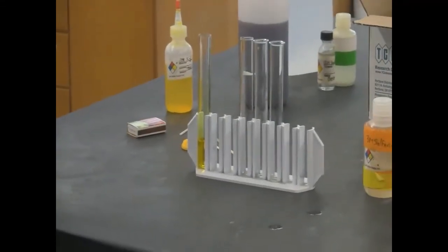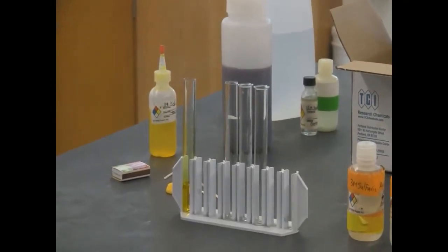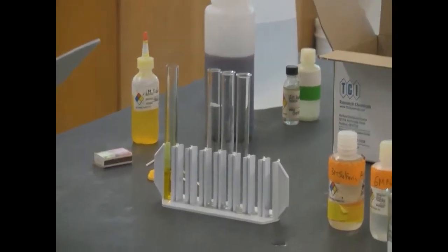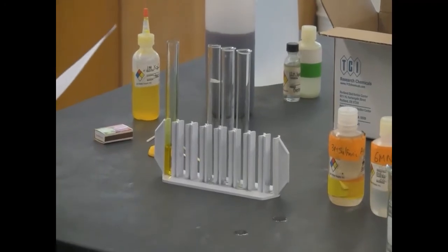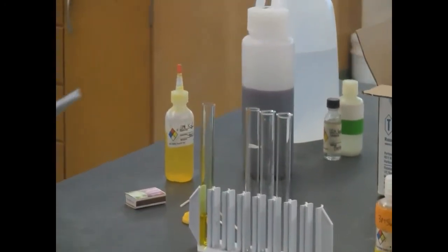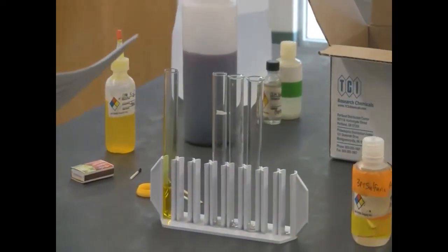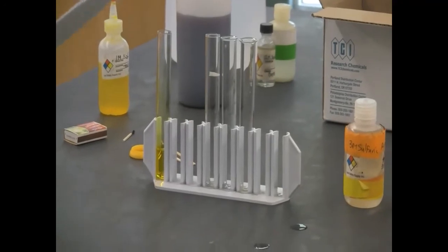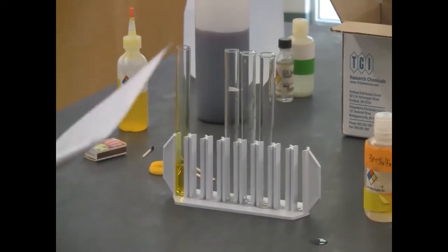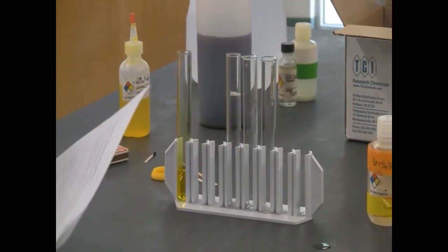Okay, after the reaction rate testing, we are moving into another section, the equilibrium testing. We are trying to check the Le Chatelier principle. So now part E, chromate-dichromate equilibrium. This equilibrium will involve some color change, so you can see which direction the equilibrium shifts and what kind of color it gives you.